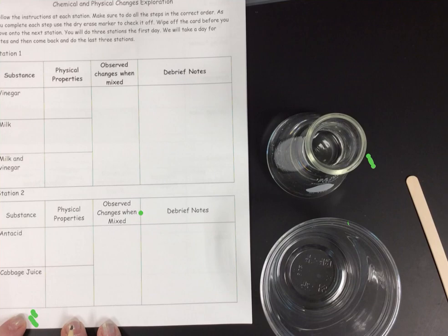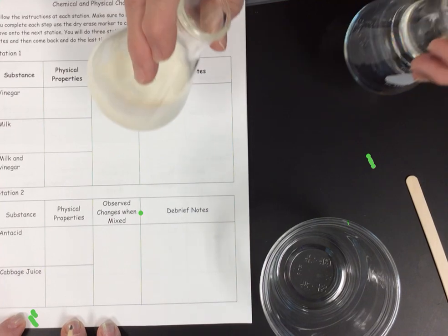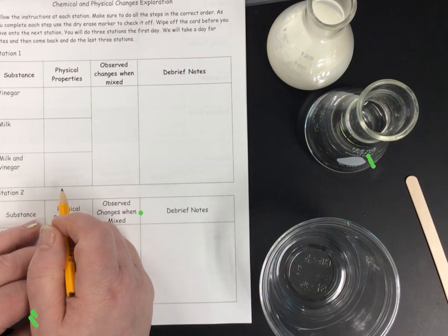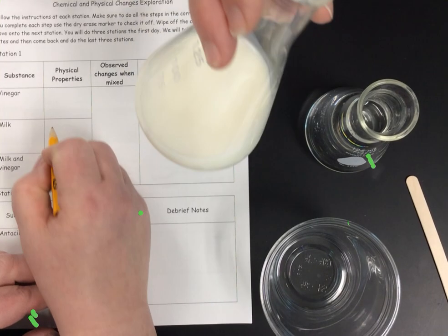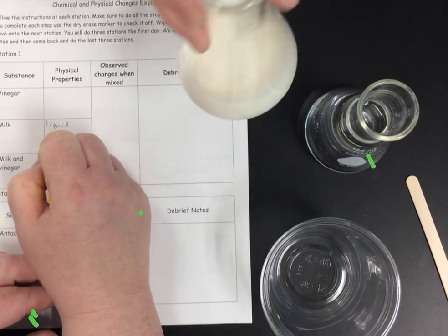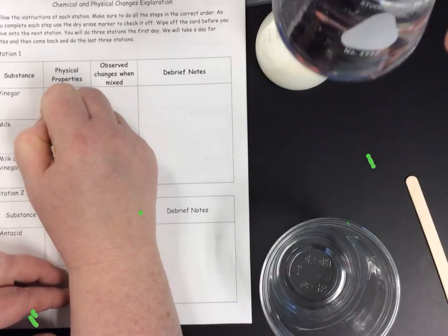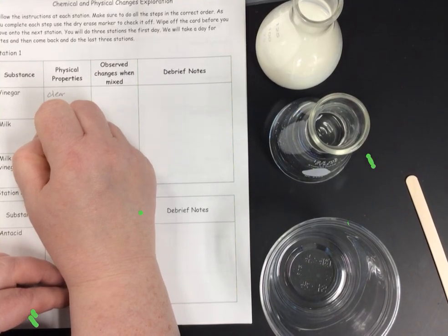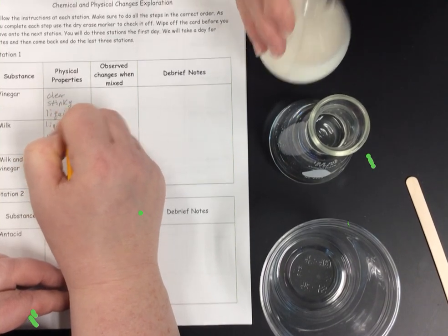The very first thing that we have are our substances. In station 1, vinegar and whole milk, and we want to talk about our physical properties. You need to write down the physical property of the milk. So the milk is liquid, white, creamy, something like that. And vinegar is clear. You can waft it to smell it. It's a little stinky. You don't have to say stinky, but it is a little bit. It's also a liquid.